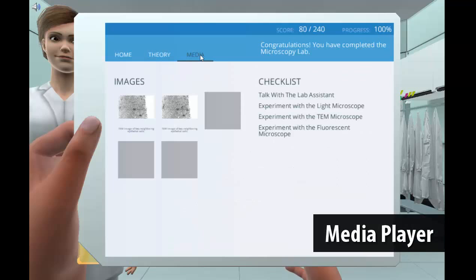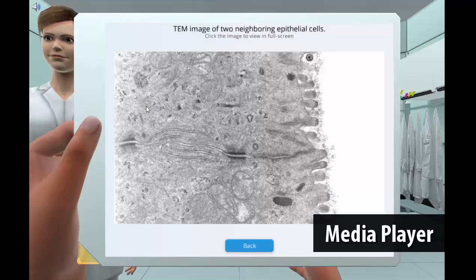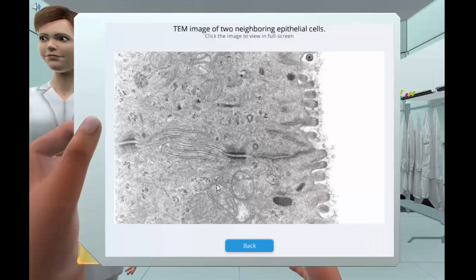Also with the media player function, students will be able to see the animations, graphs, and collected data several times during the lab and at a later time for exam preparation.